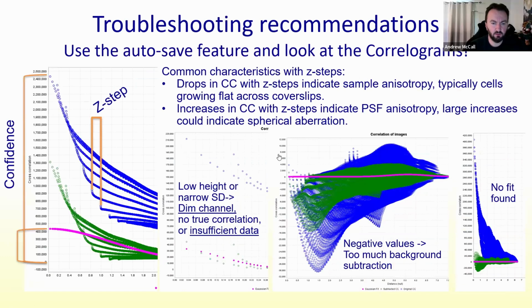Okay, let me take a break really quickly and answer Estefan's question here. How is the correlogram affected when analyzing elongated structures like fibers instead of puncta or globular structures?